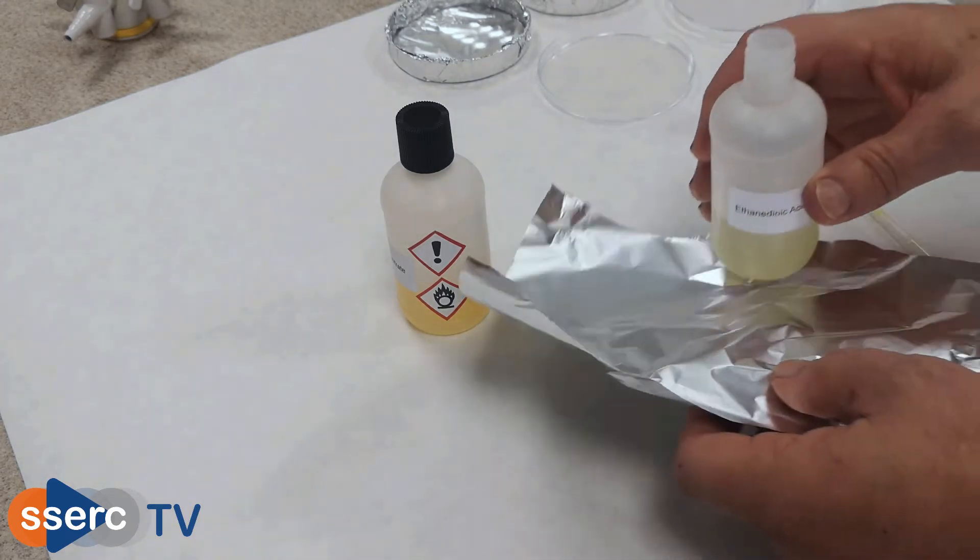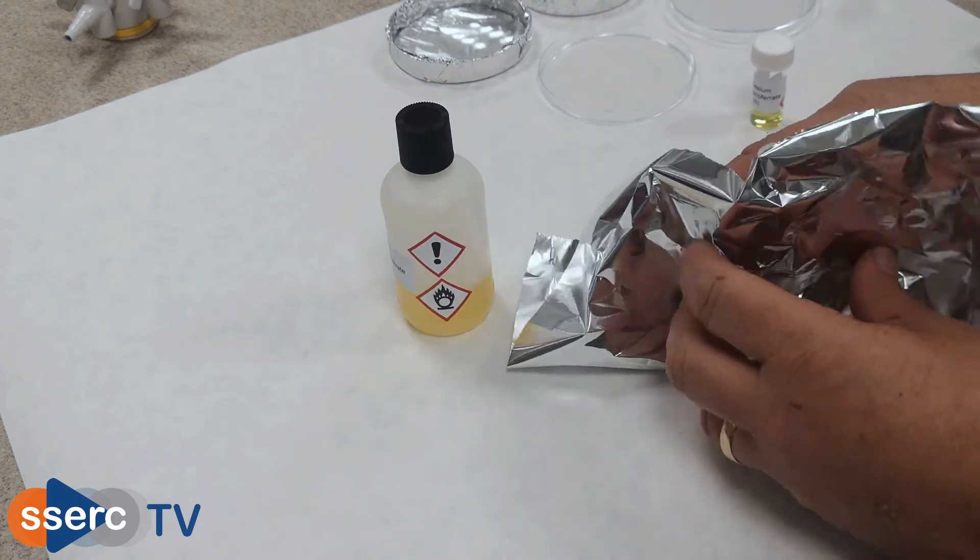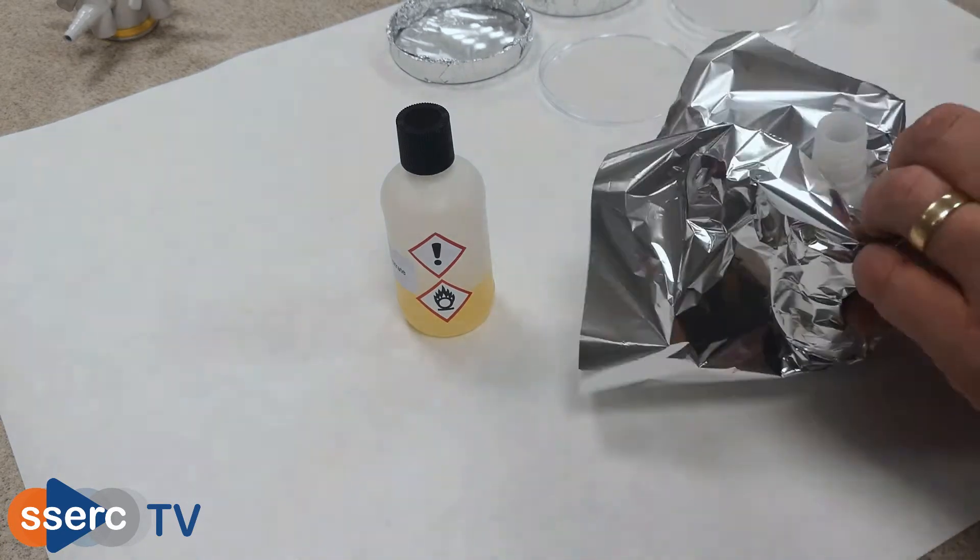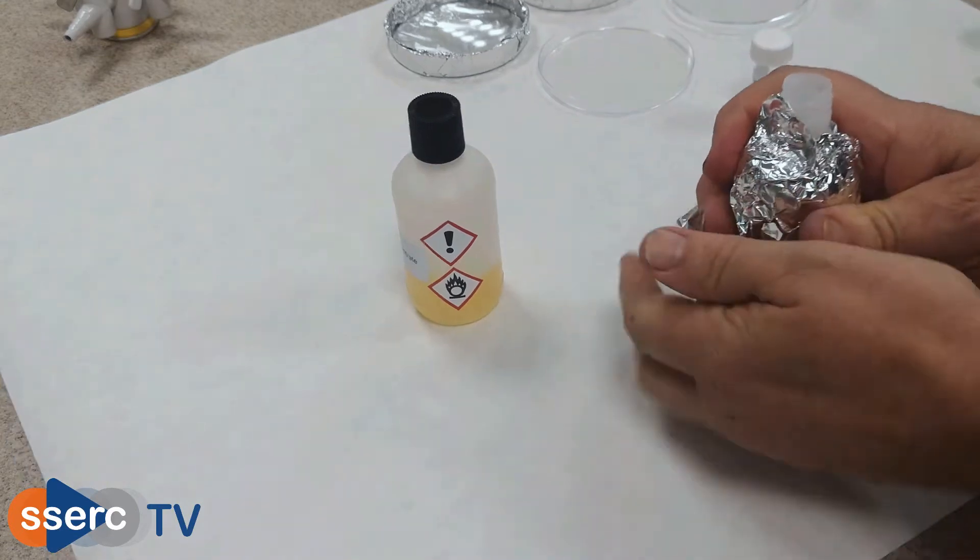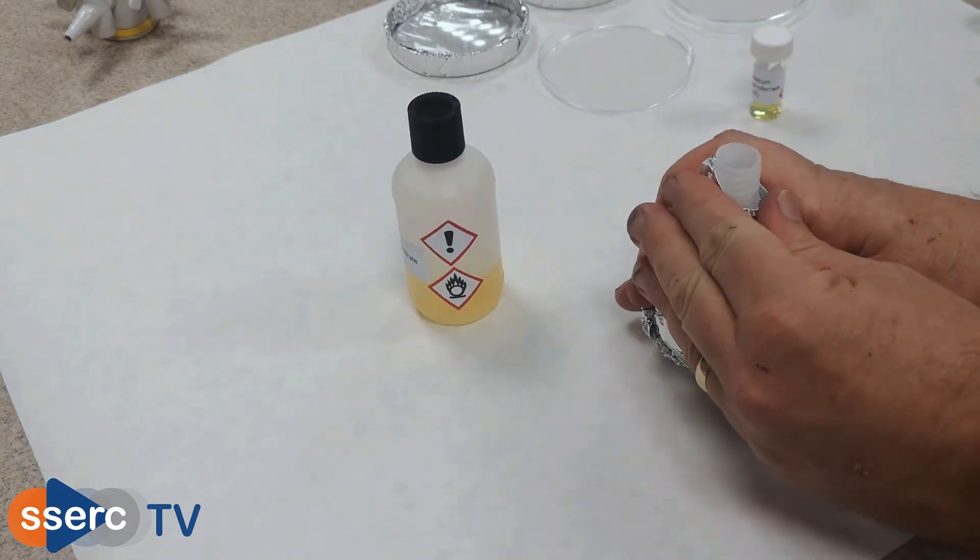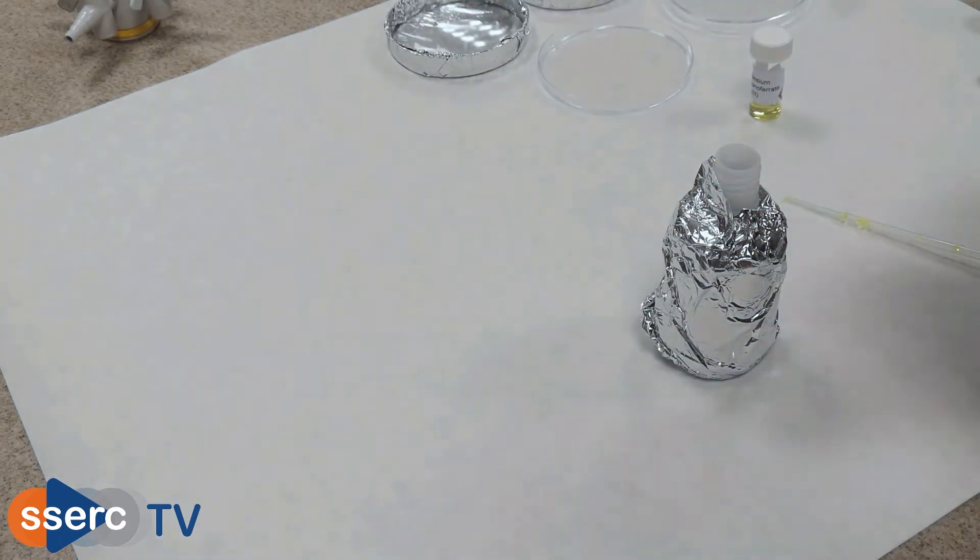Now I'm putting some aluminium foil around the bottle to keep any stray light out. You can actually do this at any time but I'd forgotten. Now pour your iron nitrate into the first bottle and give it a little swirl to mix.